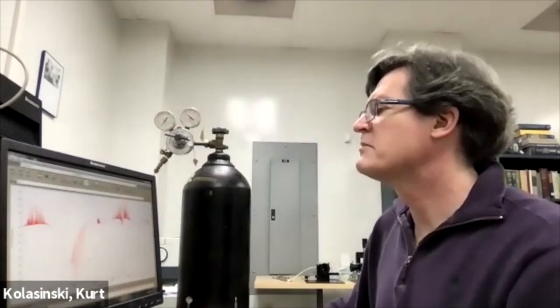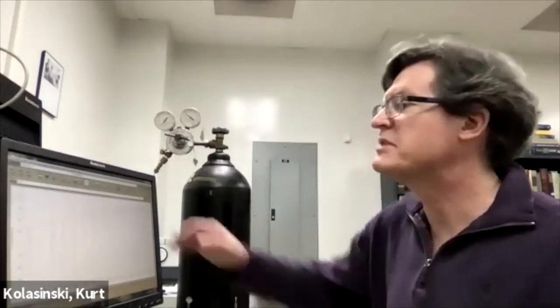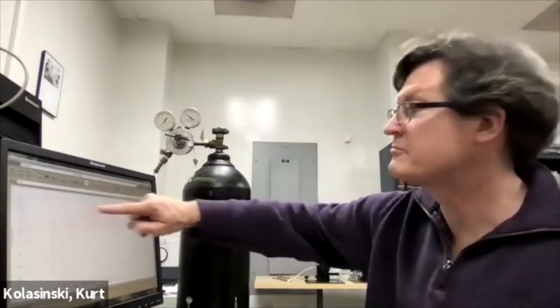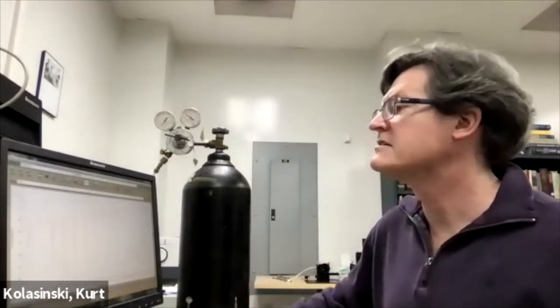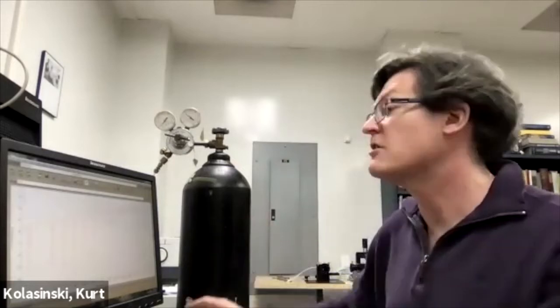Okay, what about our HCl? Did we have enough? You can see some nice big peaks, and they're changing from about 60, 65% transmission, where the background line is, to 35% at the top of the peaks. Hey, we got a 30% change. Good, we got plenty of signal. All right, great. Now, that means we're good to go.